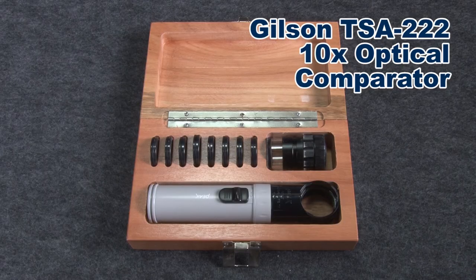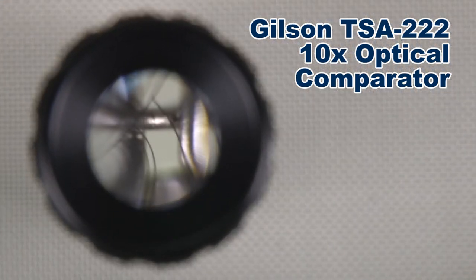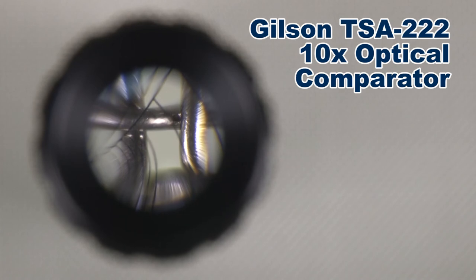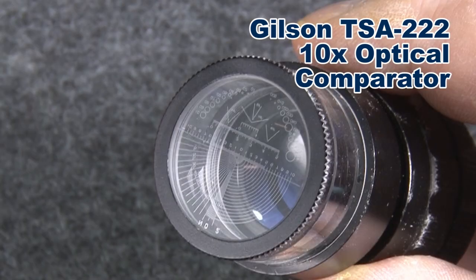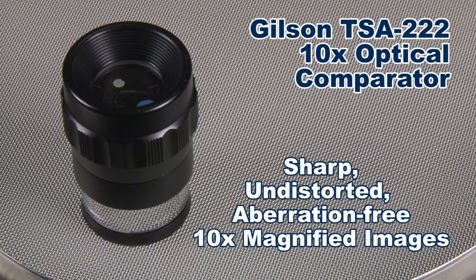The Gilson 10-inch optical comparator is a convenient tool used to identify sieve opening sizes or for close examination of the wire cloth. This optical comparator has a photo-etched precision scale on 1.2-inch diameter interchangeable glass reticles. Magnified images are sharp, undistorted, and free of aberration.